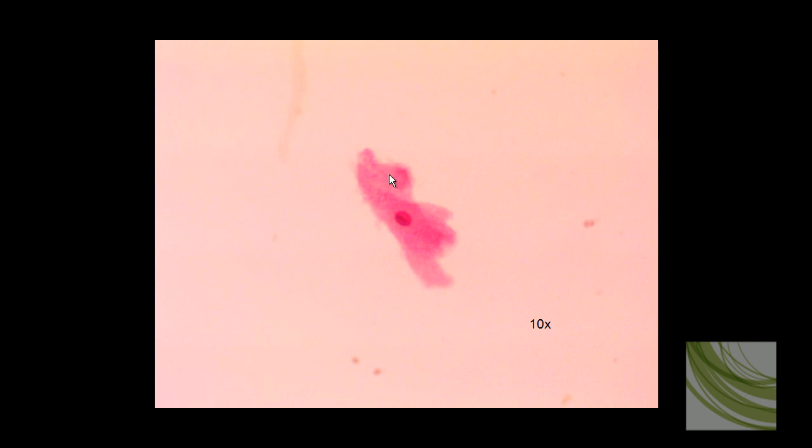We're going to now look at this one particular amoeba, zooming in using our 10x objective. Here we can see a little more detail, we can see pseudopods, and where you can see some overlapping, this indicates the three-dimensional nature of this slide. We can even see our nucleus.